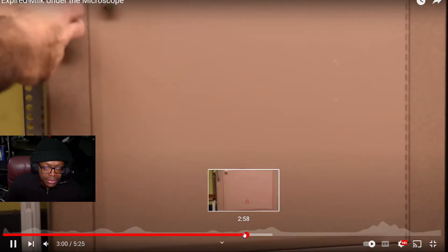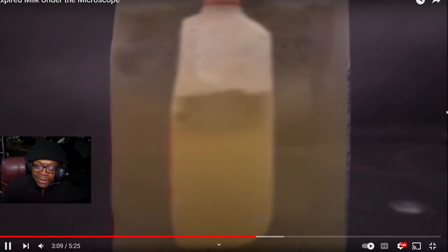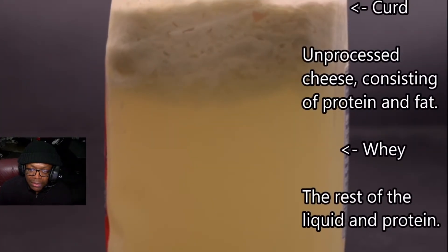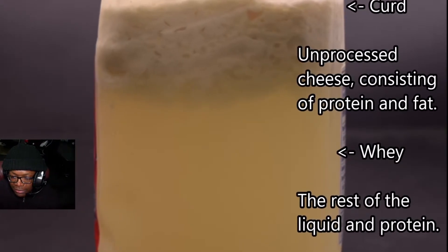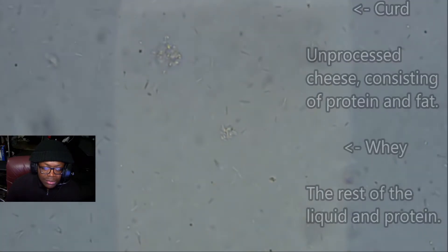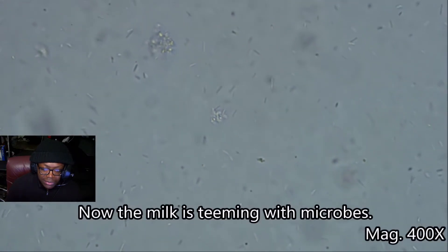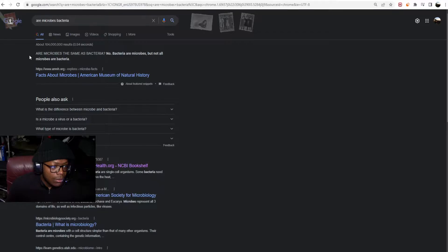He put it in the oven. So now this is what we were looking for: the curdled milk. Curd is unprocessed cheese consisting of protein, fat, whey, and then the rest is liquid and protein. Now we have a ton of microbes, a ton of bacteria.